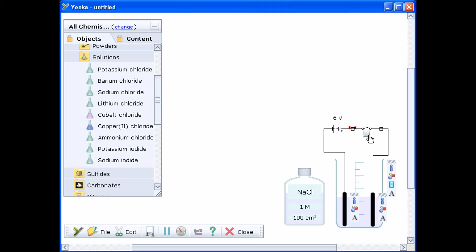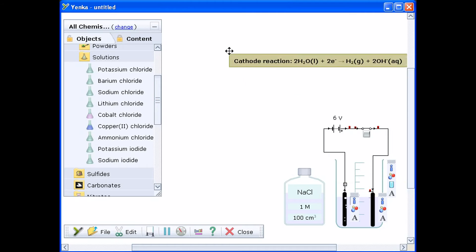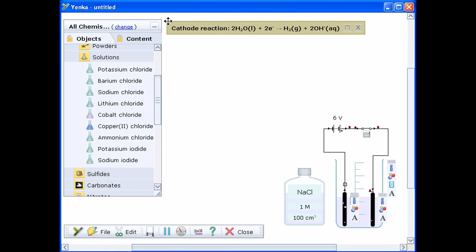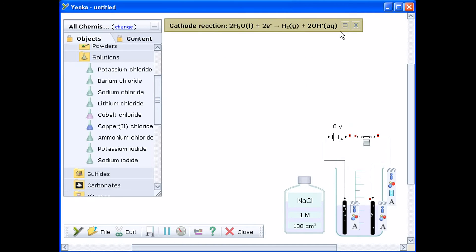To start the electrolysis, click the button on the switch to complete the circuit. Bubbles rise from the electrodes as the reaction takes place.